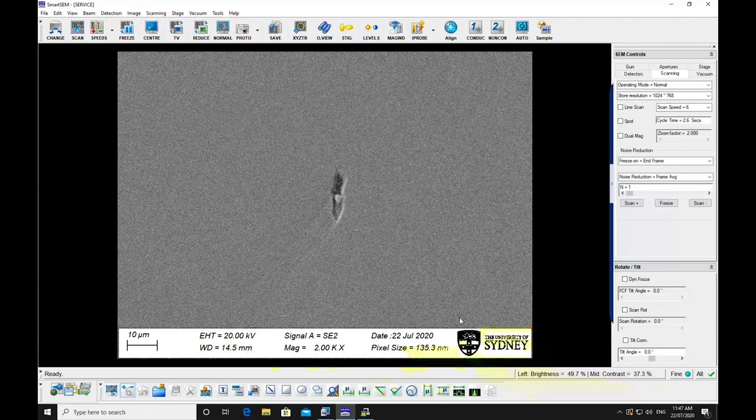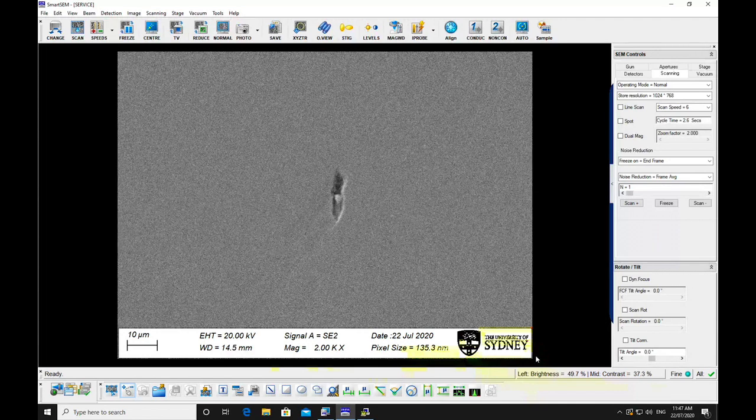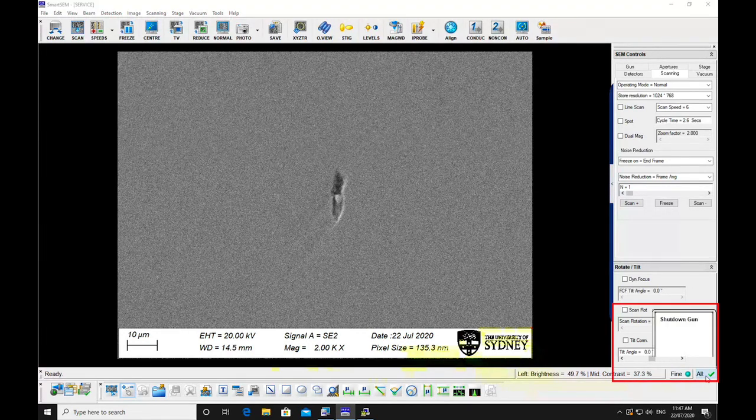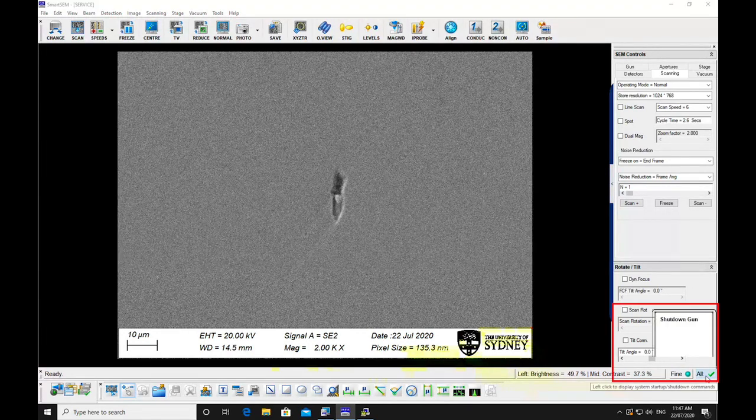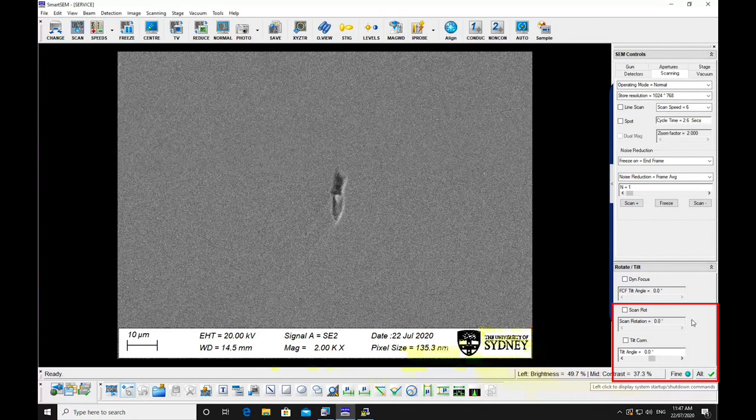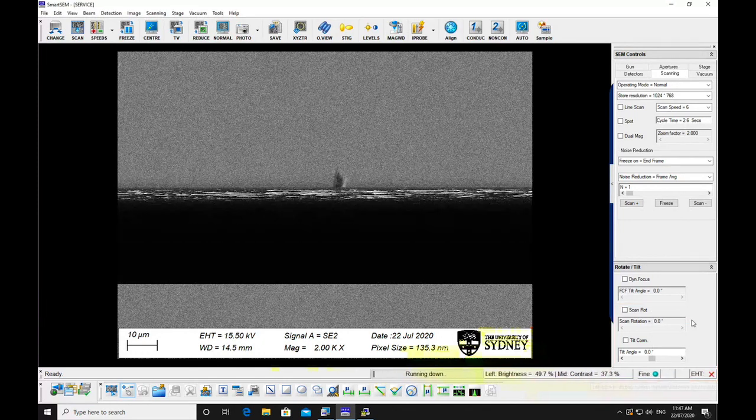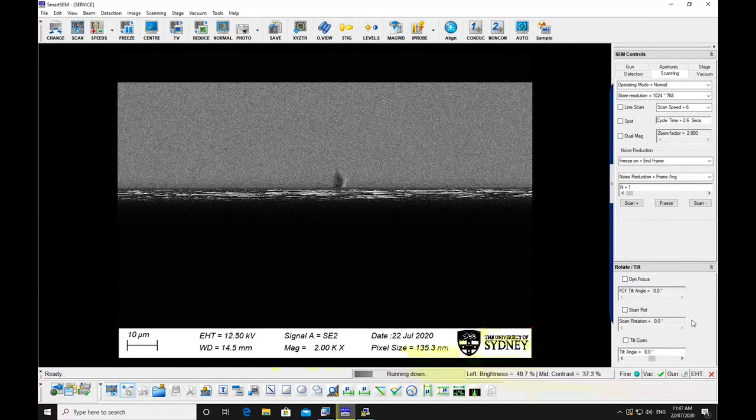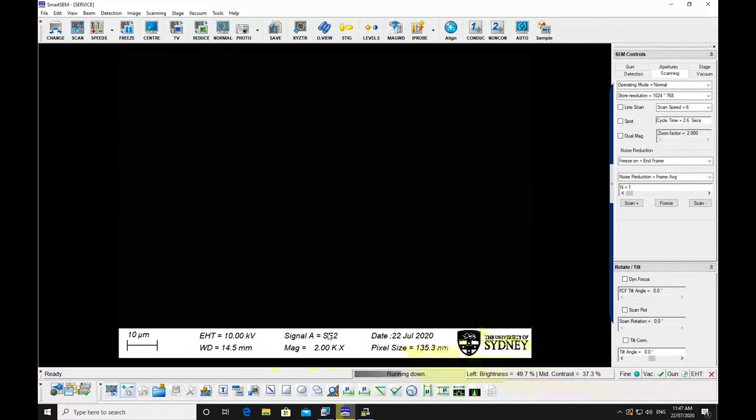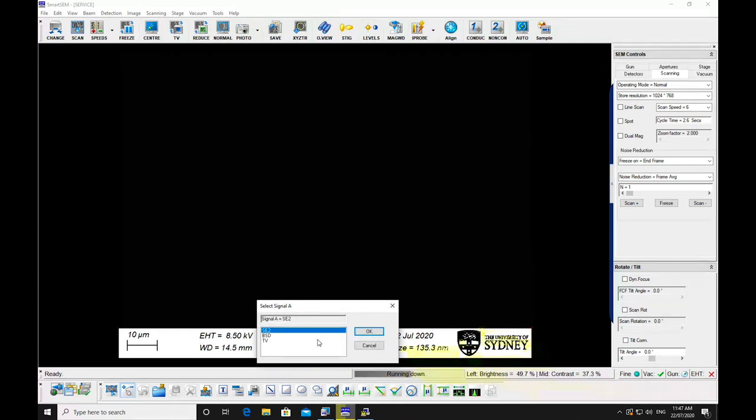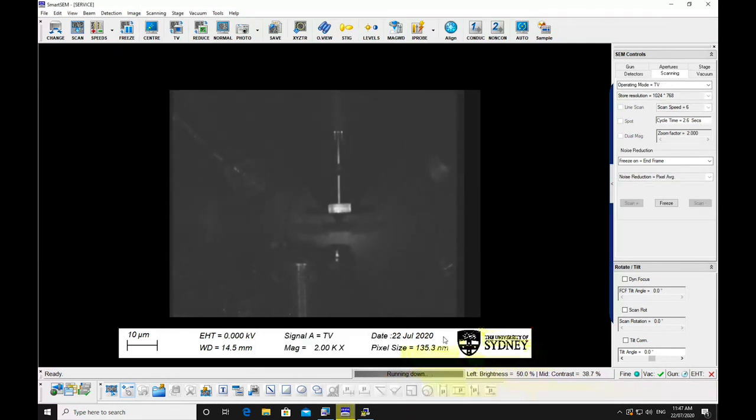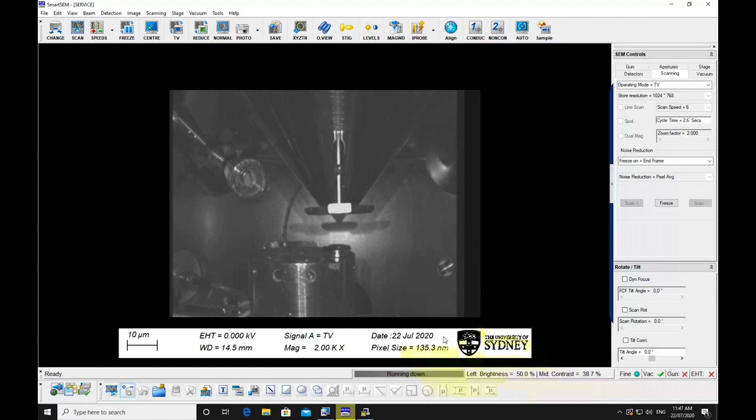Turn off the beam by clicking all in the bottom right corner and selecting shut down gun. Go to chamber camera view. Lower the stage to a safe position, approximately mid-screen in TV mode.